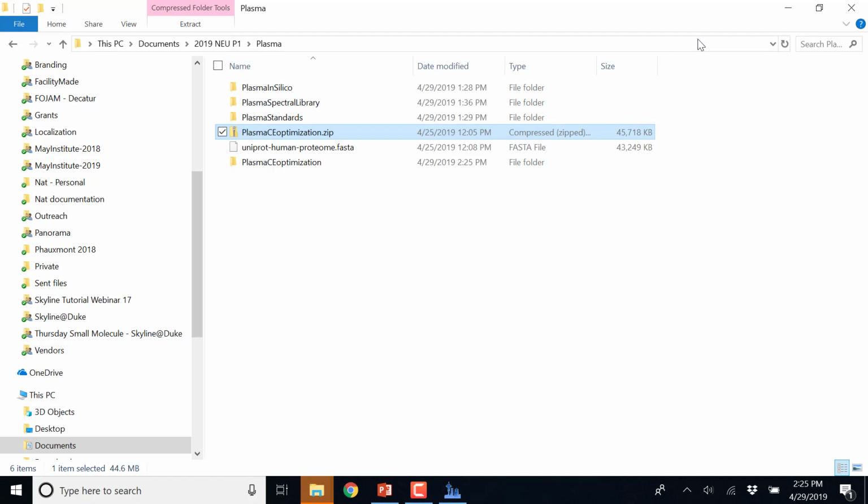So the question was, how do you get a chromatogram in for the target peptides once the peptides are in that target list side? It's file, import, results. And it would have to be a file that had targeted data in it. Otherwise, you get nothing. So we can't use it with this example. Not yet. We will have other examples that we can show you how to do that with.